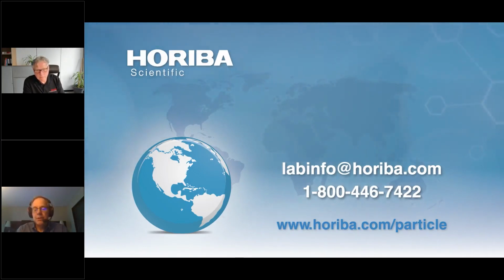You can get some details you can't get otherwise. Your particle flow you can correlate to shape information, and if you've ever tried to do a flowability measurement on particles, you realize it's just not really a routine thing to do. It's very valuable information, but this is just a whole lot simpler and more repeatable. So I'd say no on the adjuvants, but I'd say both organic and inorganic excipients, particularly for solid dosages, this is very, very applicable.